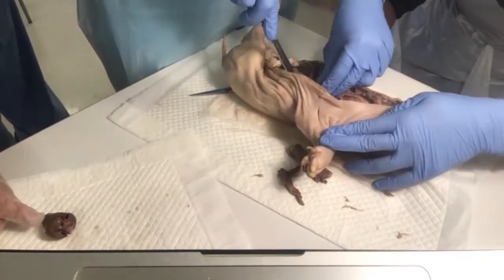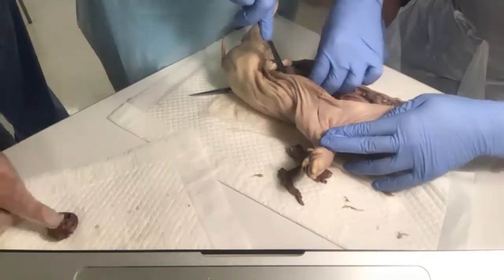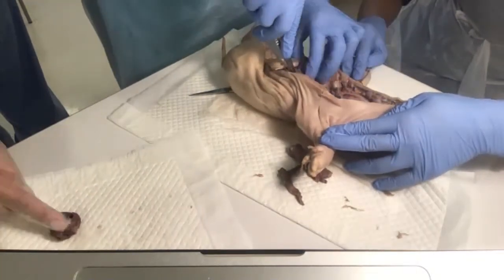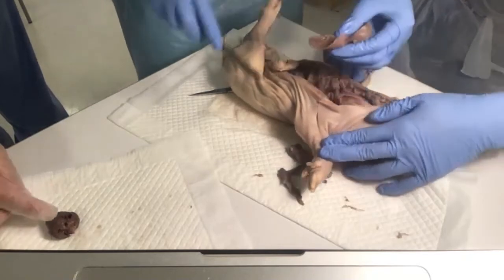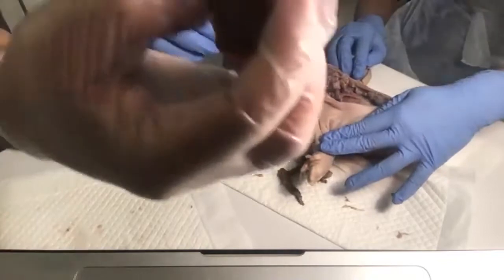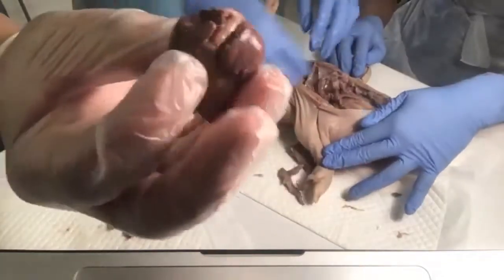Ooh, look at this. This is a big vein. Isn't that my coronary sinus? Right? You feel it. It's squishy. And then you have the posterior interventricular sulcus going straight down to the apex. So this is back and this is front.